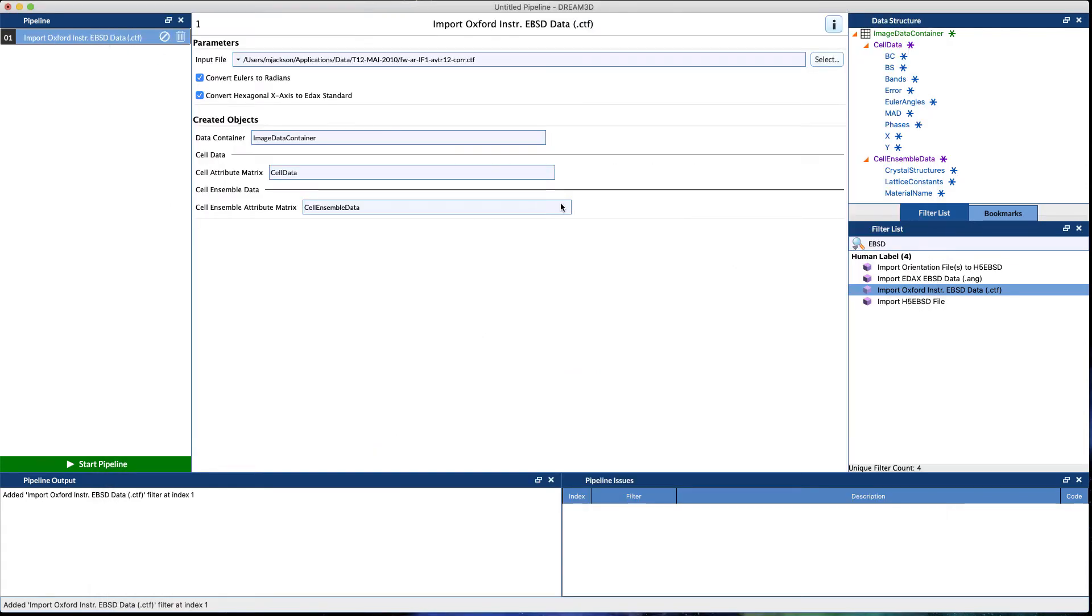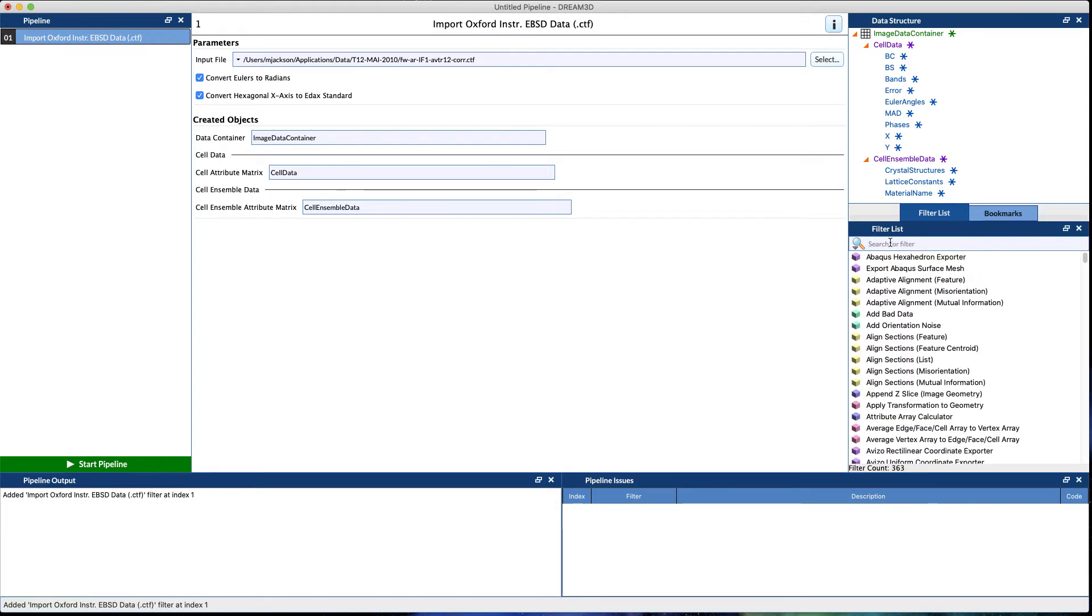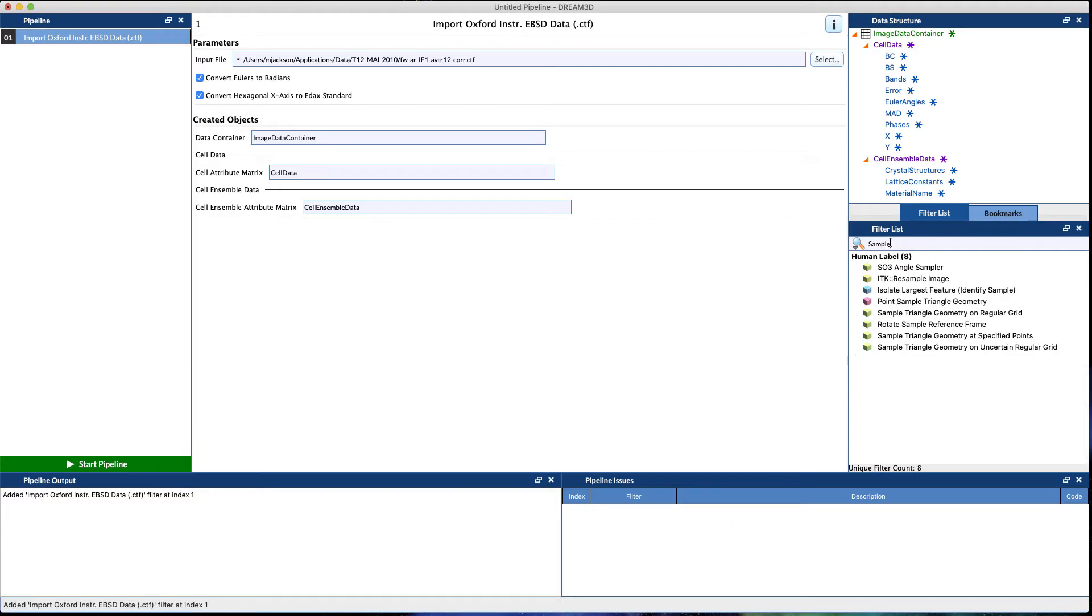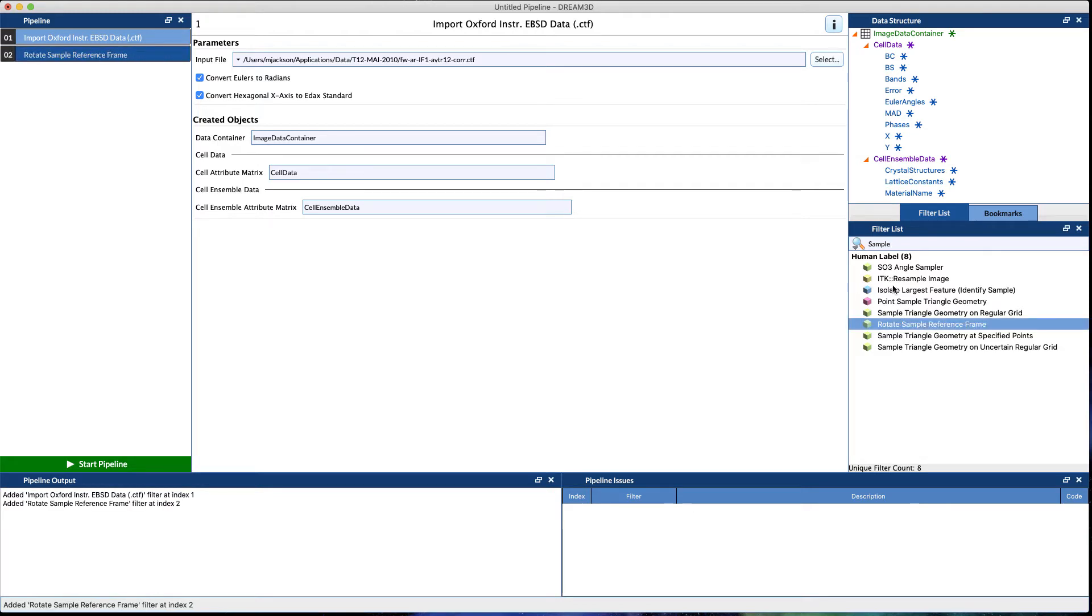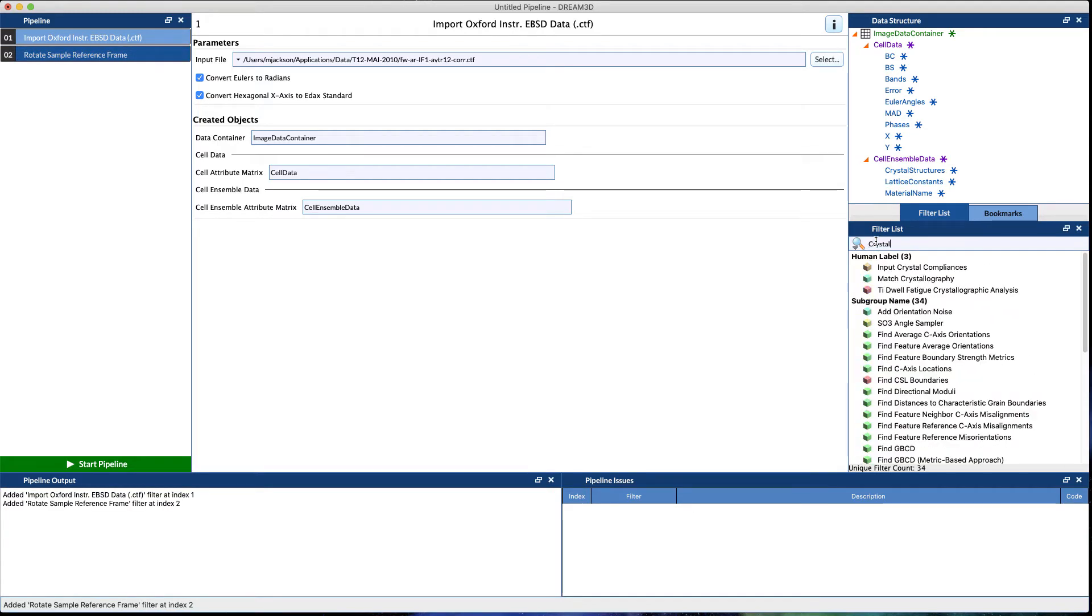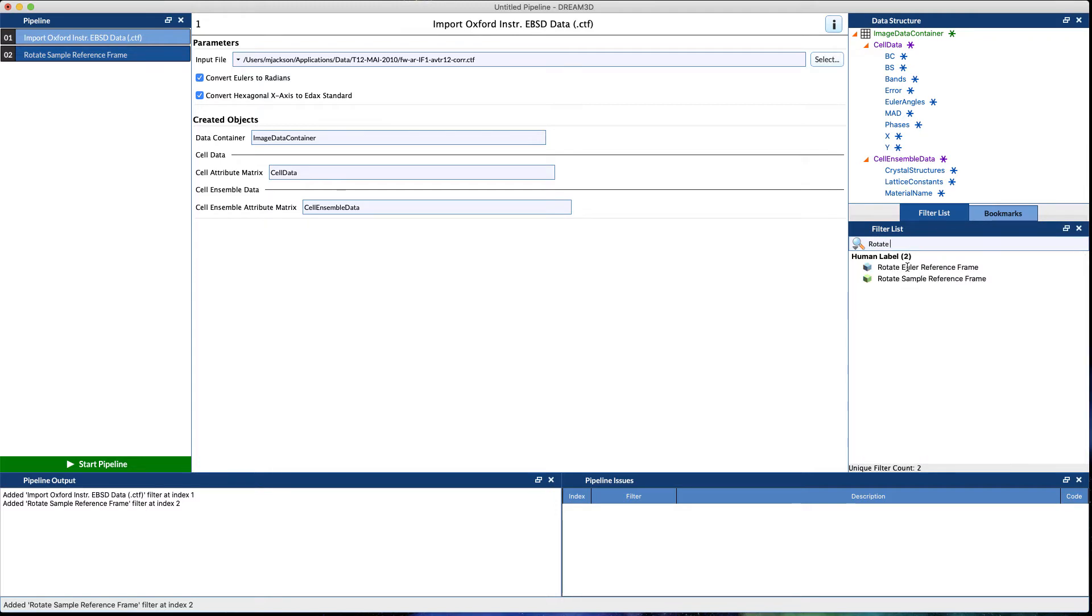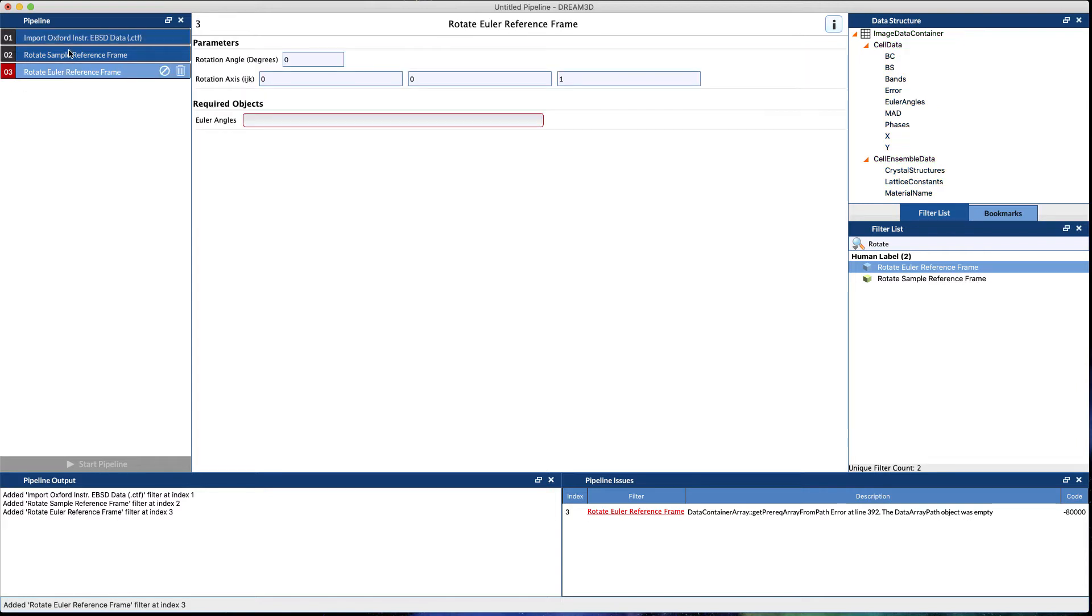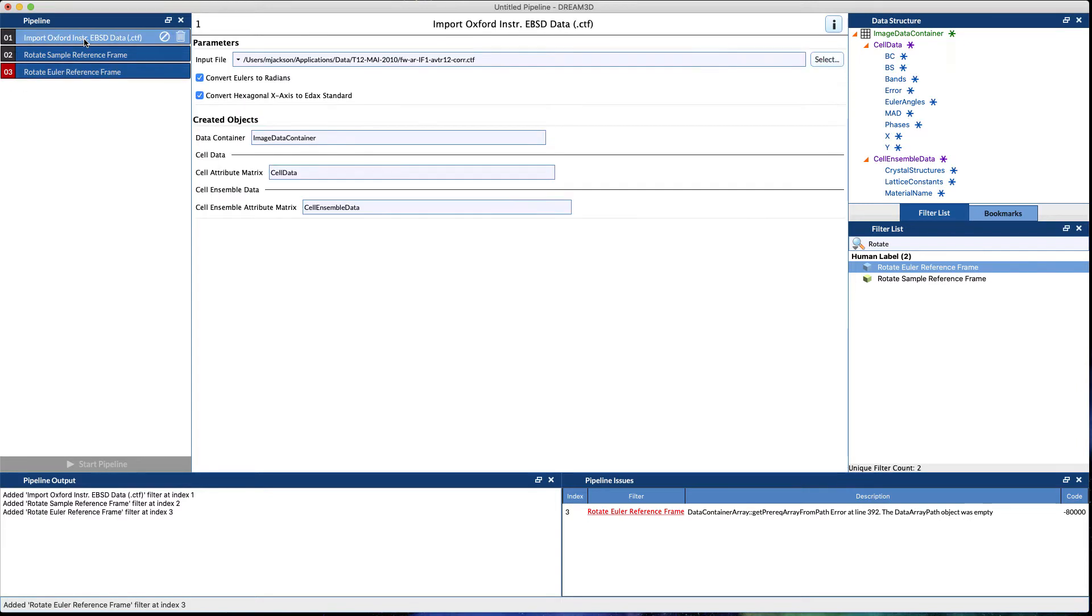Once we have the data in, typically how the EBSD systems work, the sample reference frame and the crystal reference frame are not coincident. So you typically want to modify the reference frames so that they can become coincident, and we call it the Rotate Euler and Rotate Sample. Now some of these are needed and some of them are not.